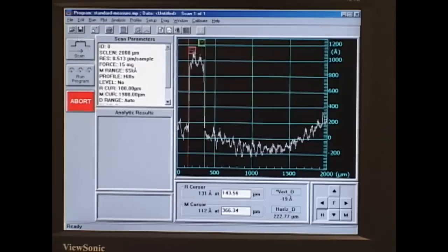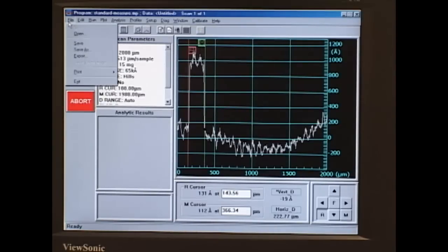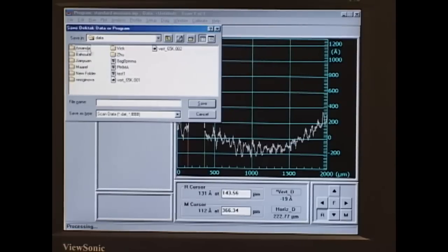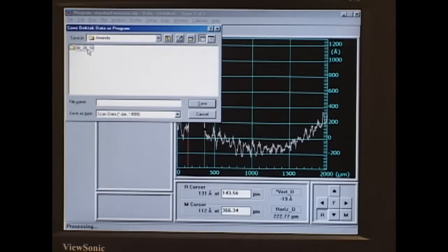So when we've finished our scan, we can go up to File, Save As. We'll go into the data file, which is located on the desktop. You can find your folder, or if you don't have a folder, you can name one. You may want to use another folder with today's date. And then you can save your sample.